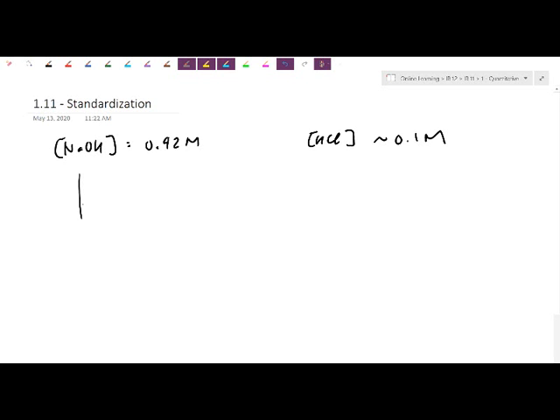I used a burette, and basically what I did is I used that last little bit of solution that I had, and I transferred in 8 milliliters into a volumetric flask. I know the volumetric flask here doesn't actually give me lines graduating and marking the size. I know 8 milliliters from the burette. As long as I have one tool that can read the volume, we're still fine. 8 milliliters, we were really, really close. I know this was a 100 mil volumetric flask. So by the time I hit that mark there, I'm exactly 100.